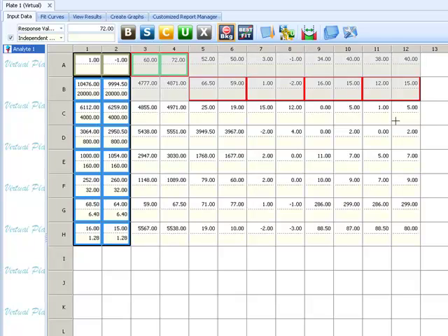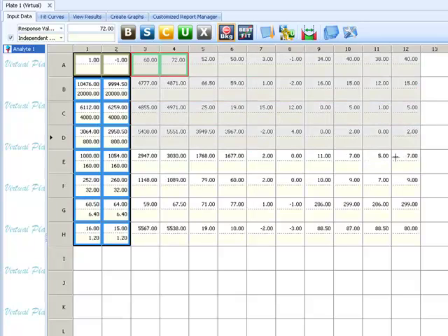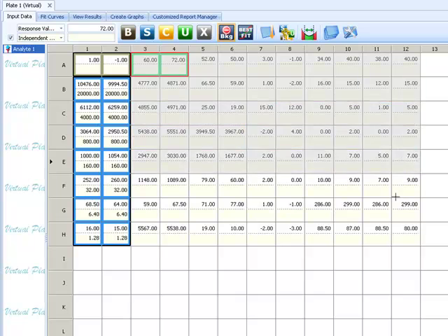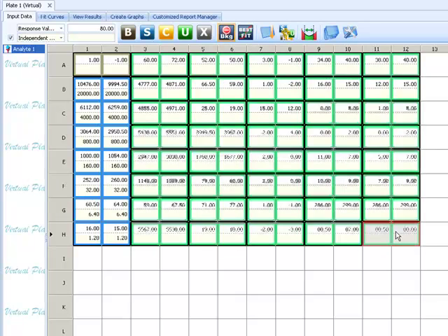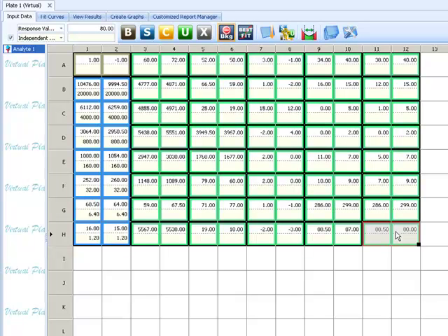Grouping them by replicates will allow me to obtain additional statistical information such as mean, standard deviation, and percent CV.